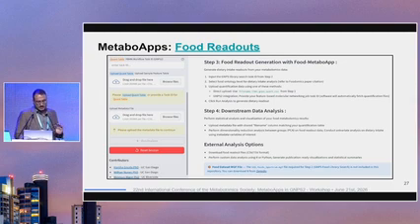But just talking about the workflow itself, for the food readouts you also need to have a task ID for the job you performed on GNPS. But the difference in this case is that you also need to upload the quantification table, as we're working with estimation. So you need the quantification table as a separate resource that you upload to the tool. Unless you're doing the downstream analysis, that's a different thing.